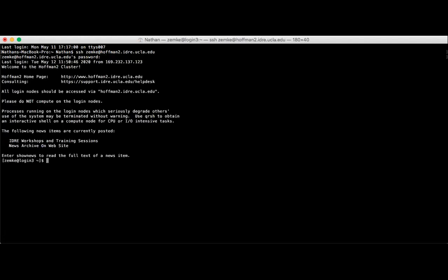And these are probably things you've covered before. Sorry. If you're gonna copy and paste the commands, don't include this $. Start the command. Sorry, I guess you can't see what I'm doing. Hold on one second.